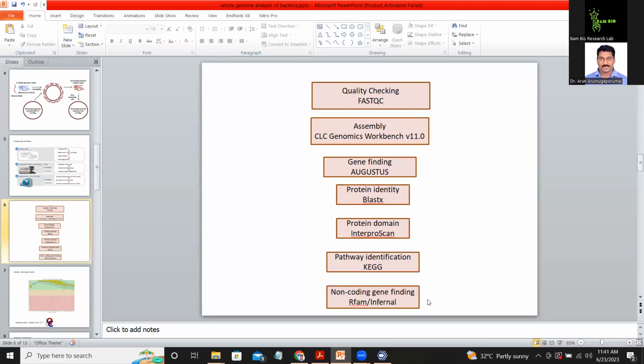So this is all about the basic analysis and annotation of a bacterial genome. Now we will discuss the applications of this genome sequence. You have a bacterium, you isolated the genome, sequenced it, then by using these bioinformatics tools you analyzed it. You have the annotated genome. What can you do with it? That depends on the biological problem you are working with.